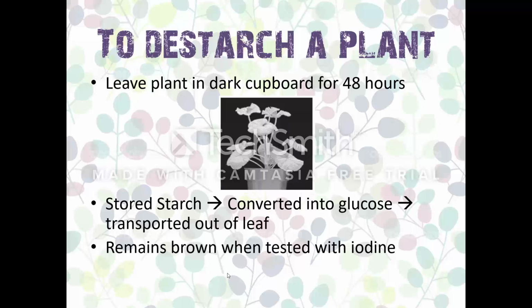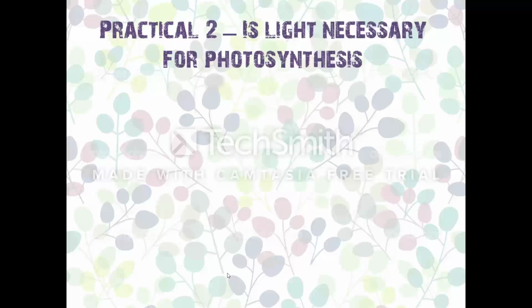Okay, so we know that if we've taken the starch out, then now we can use that plant to determine different factors. Okay, so we're going to use that information repeatedly, so please just keep all of that in the back of your mind. It's not the first experiment, but it's the first factors experiment that we're going to do: to talk about proving whether radiant energy, light, is necessary for photosynthesis.